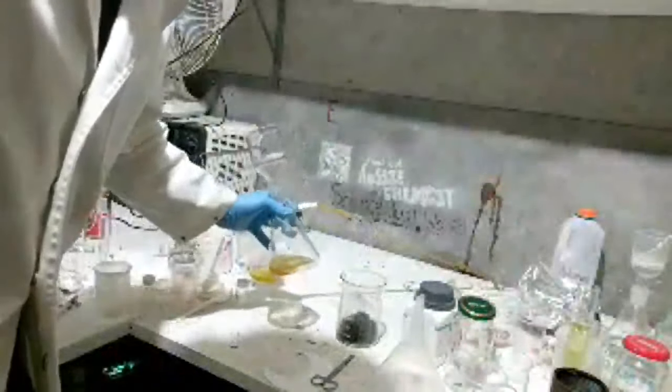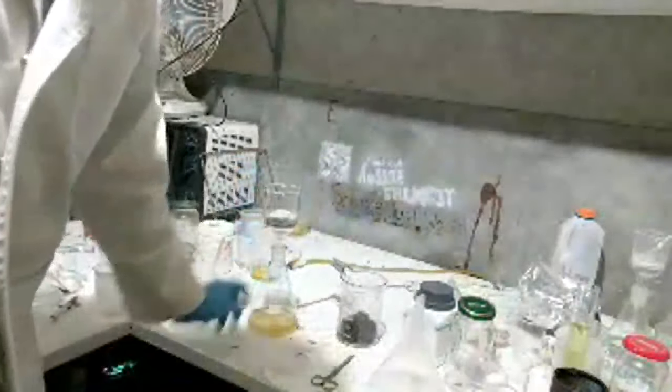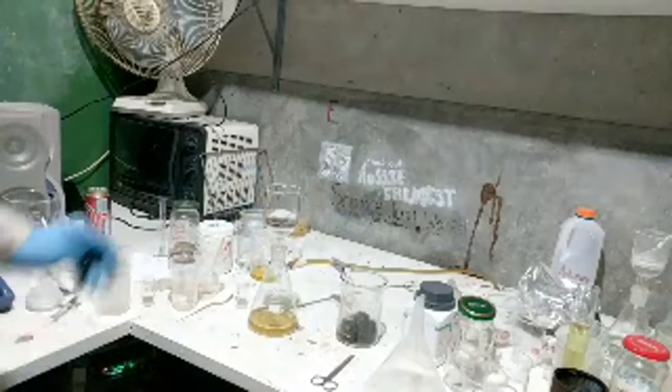And that is fucking yellow. Look how yellow that is. Absolutely horrific. Nice potassium nitrate crystals down the bottom. So yellow. So bloody yellow.